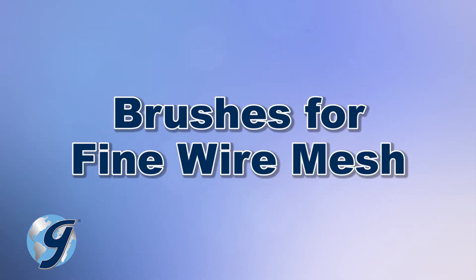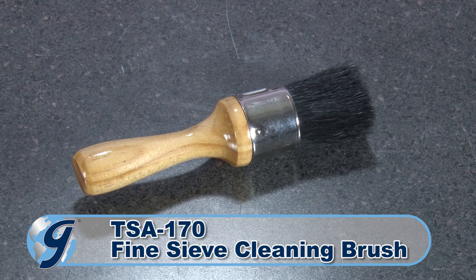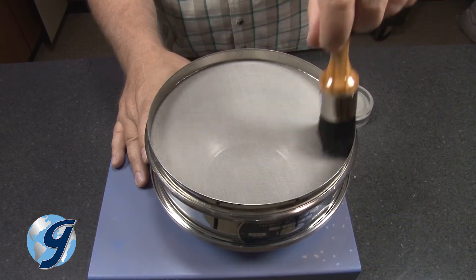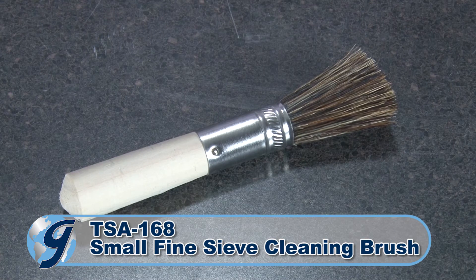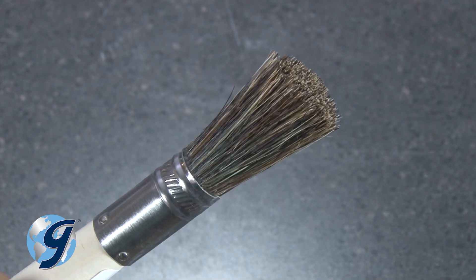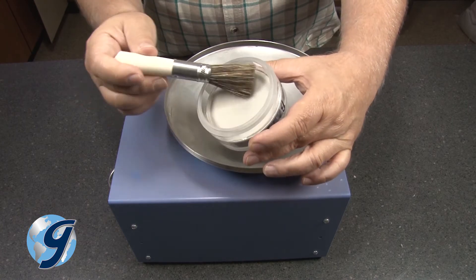For cleaning mesh number 16 and finer, the Gilson TSA-170 fine sieve cleaning brush with its soft natural bristles is ideal. Also, the Gilson TSA-168 small fine sieve cleaning brush has soft 100% china bristles for easy use with fine mesh sieves or precision electroform sieves.